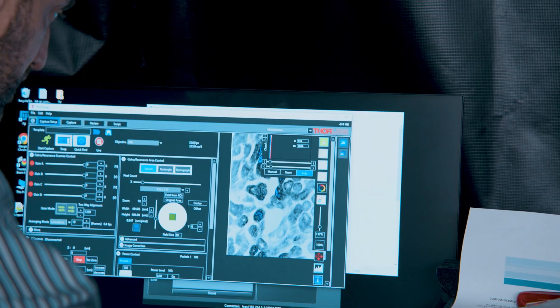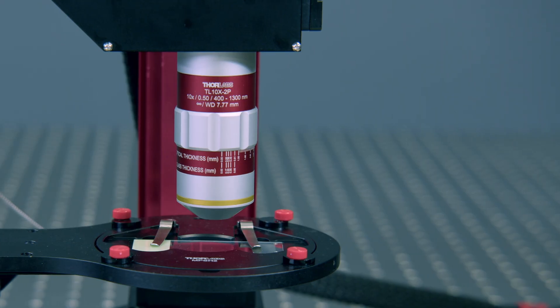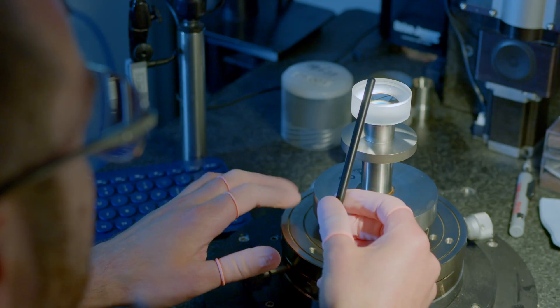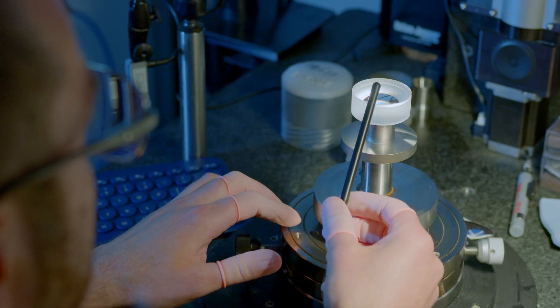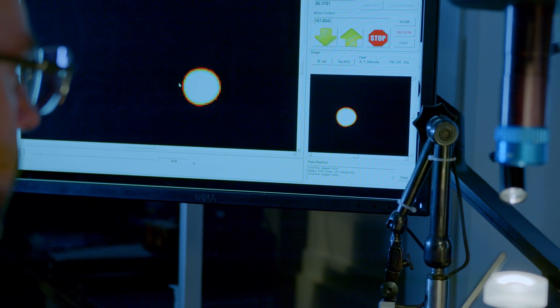The same is also true for industry — it's essential to the multi-element product line. As we progress with our objective line, we learn that just having performance information is not always enough. We serialize our objectives so that when we do final testing in-house, we link and save that data to the serial number, capturing the actual performance of the lens when it was manufactured.